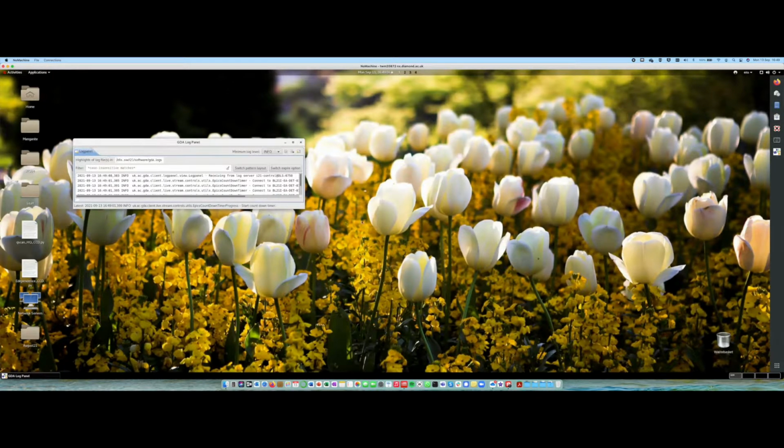This will show you this log panel of GDA, which is just running a set of tests. You will get all these errors at the beginning. This is normal. It's just like any motor that is not currently connected to the beamline, so it will show as an error, but you shouldn't worry about that. This doesn't have any impact.